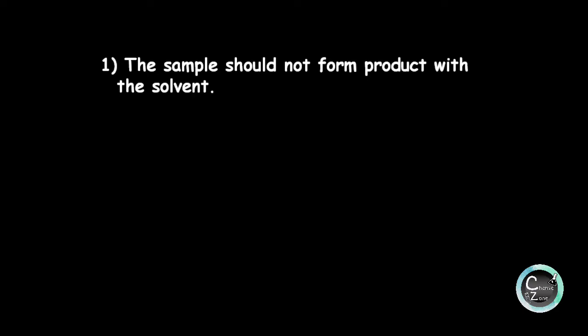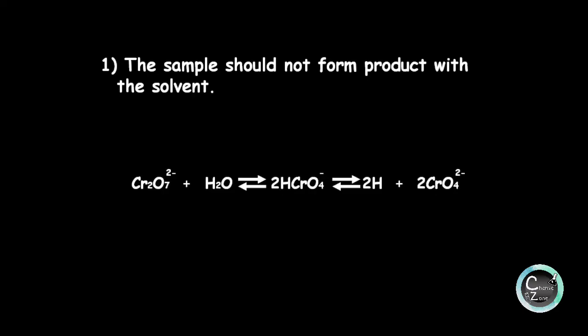This is because potassium dichromate reacts with water to form other products which absorb light at another wavelength. But on adding excess acid, the hydrolysis can be prevented and we can determine the absorption of potassium dichromate using acid.